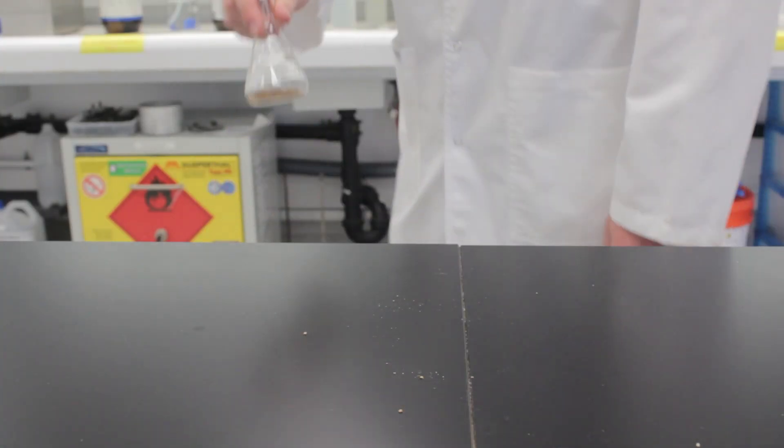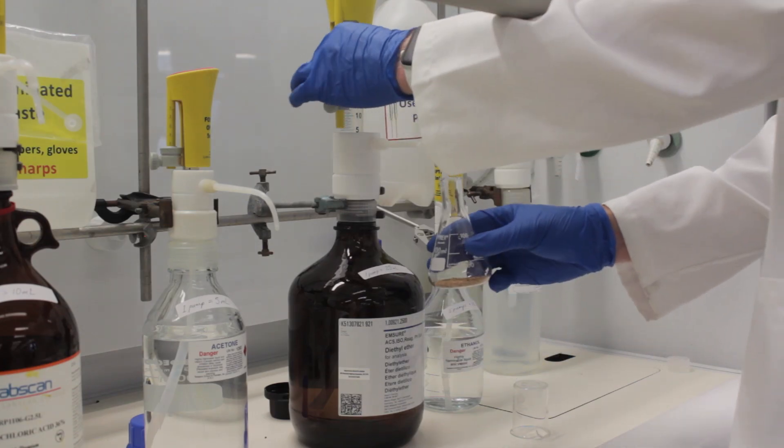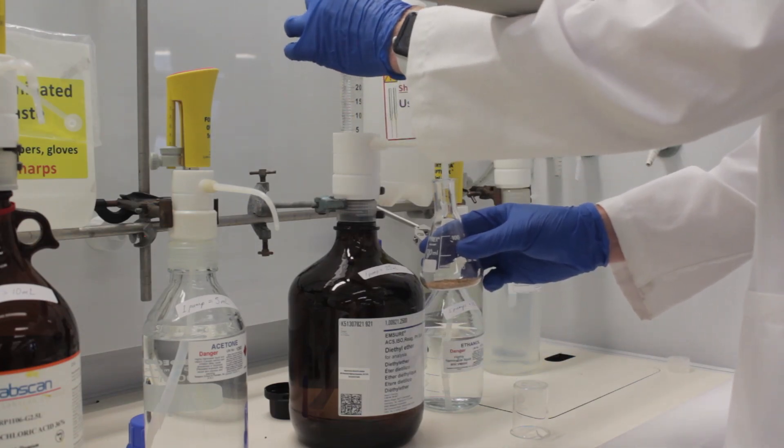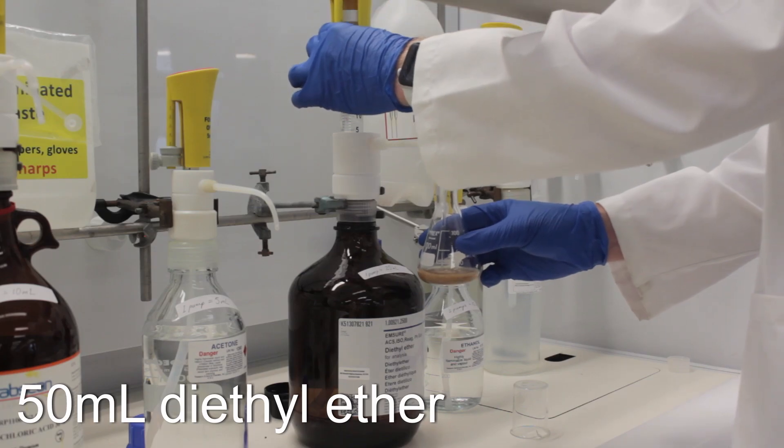Now we need to actually extract the trimyristin from the powder. Take the flask and a 50 ml beaker to the fume hood and add 50 ml of diethyl ether using a pump pack.